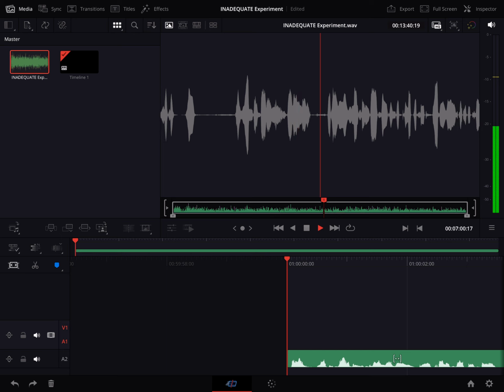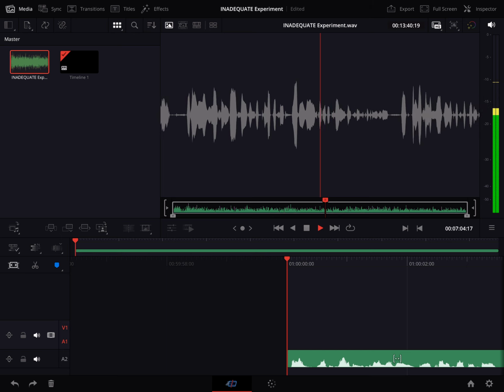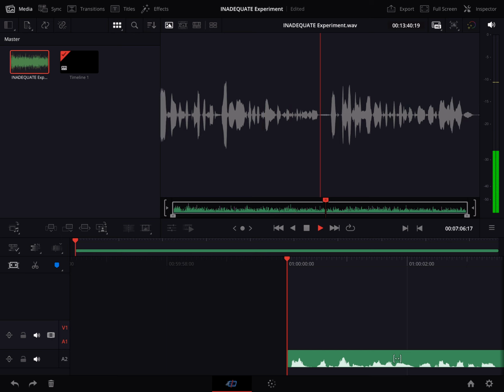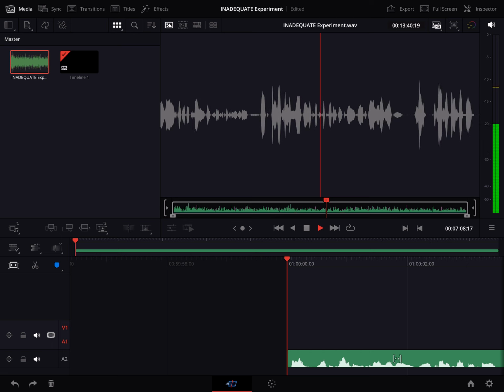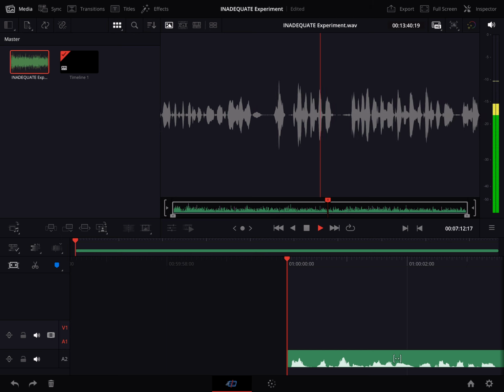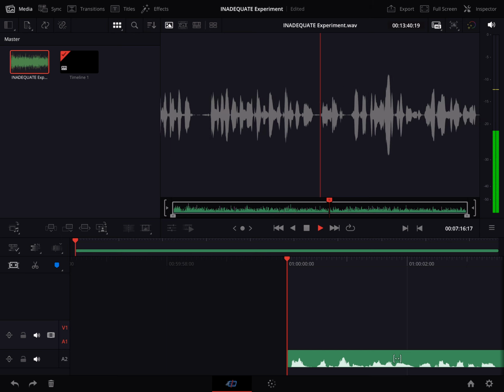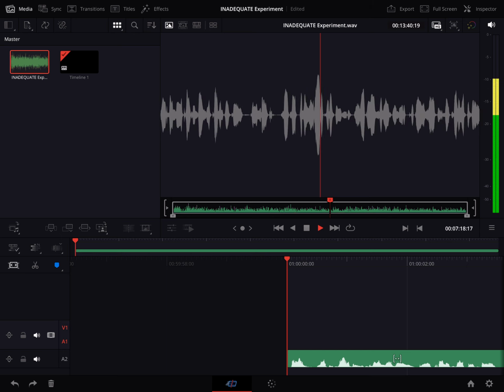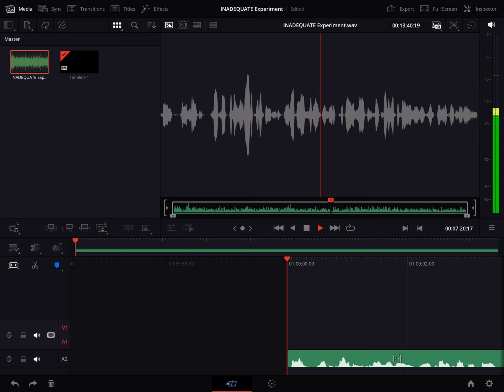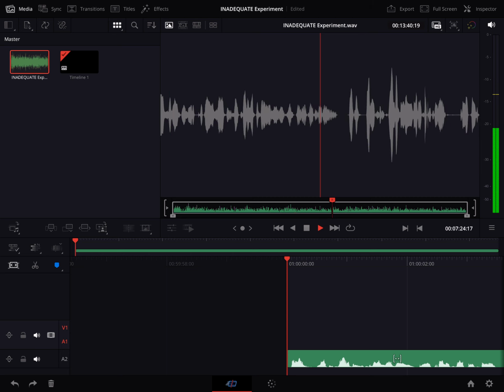I know, right? But earlier you mentioned that scientists have come up with some clever ways to overcome that sensitivity issue, like enriching the sample with extra carbon-13. Can you explain how that works? Sure, it's actually pretty straightforward. Basically, they're increasing the concentration of carbon-13 in the sample. So it's like giving inadequate a boost, making those signals easier to pick out. Exactly. It's like turning up the volume on that whisper we were talking about earlier.